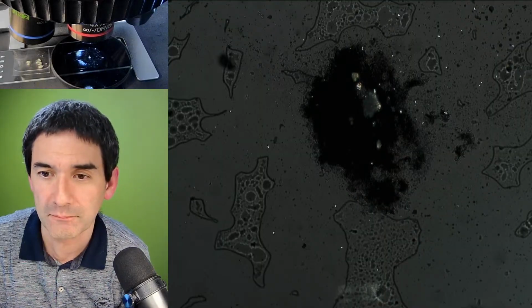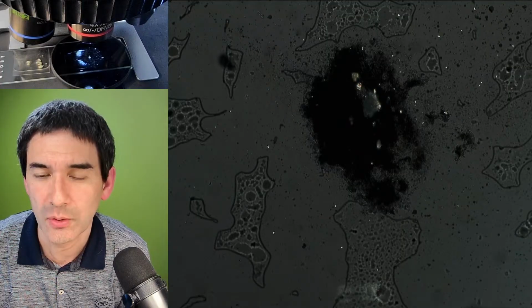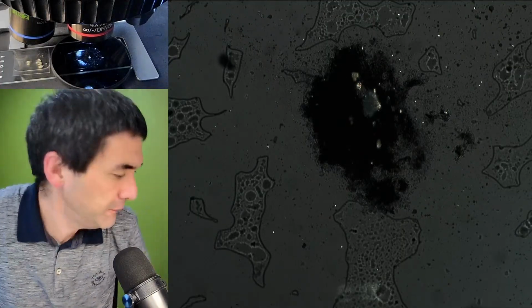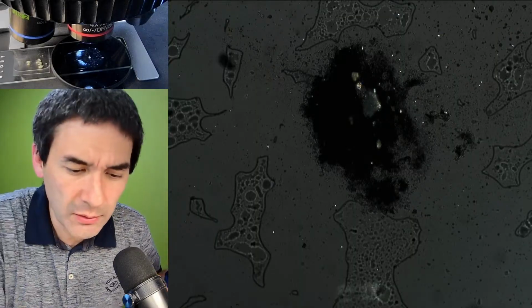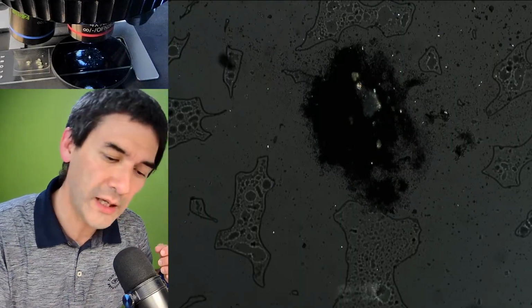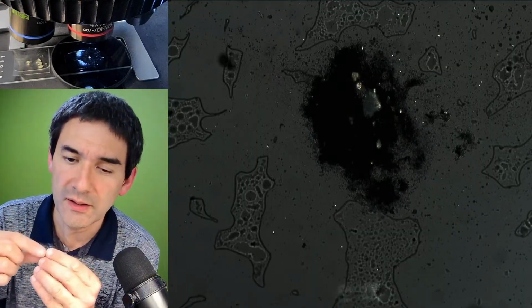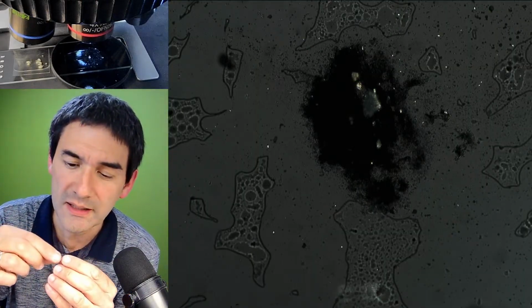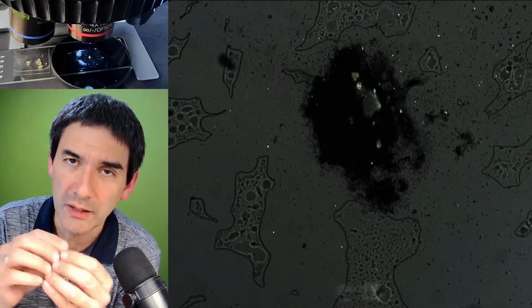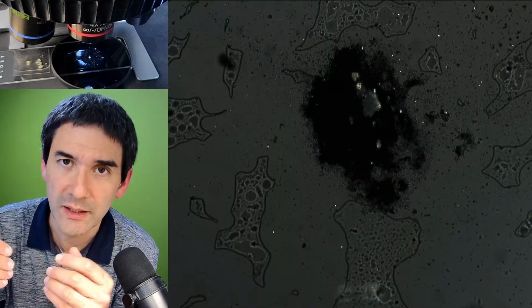So what makes something polarizable? If you've got cellulose tape, and the fibers, like the polymers, are oriented in a certain way, then they're polarizing. I don't have this here now, but maybe I'm going to do this in a future live stream.